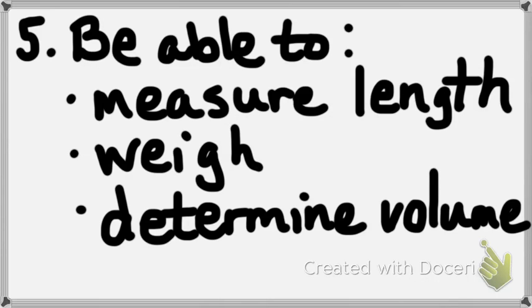So you're going to have some skills that you have to do on the test. I've got a seashell in my hand. What if I have to do the mass of the seashell? What instrument do I use? No, the mass. The triple beam balance. I just want to caution you, the only way you can mess this up is if you forget to put the weights in the notches. The back two rows have notches that the weights fall into. Make sure you're putting the weights in the notches when you're moving the weights around.